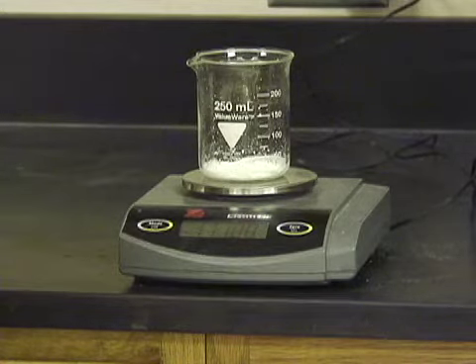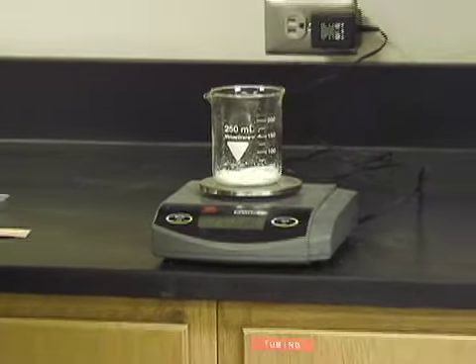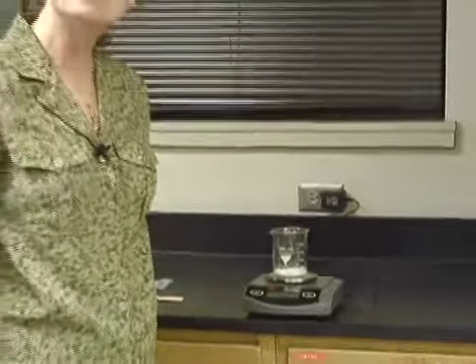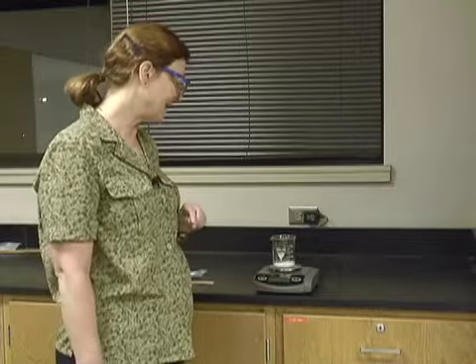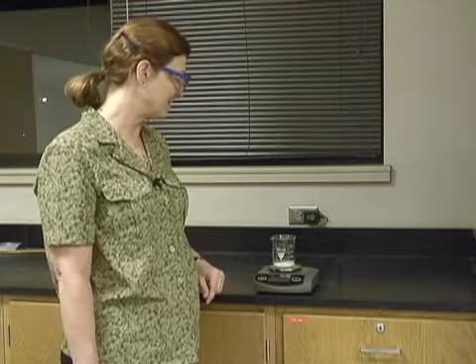Isn't that amazing? I would have never believed it come out exactly 0.00, but we have to show the 0.00 because our scale will measure to that accuracy. And those are significant digits in our lab. And the mass of it is 111.00 grams of my magnesium chloride product.